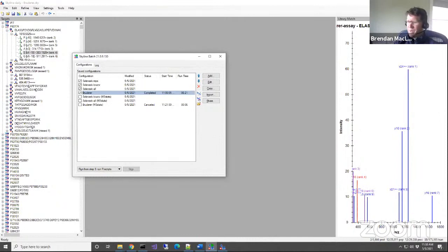Okay, why do we need the option to edit isolation scheme? Is there any instance when the isolation scheme in the raw data will differ from the one I want in my Skyline document? Well, it's frequent, you may design an isolation scheme before you acquire any data, and Skyline allows you to do that.